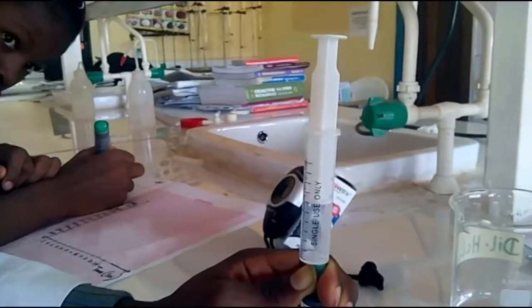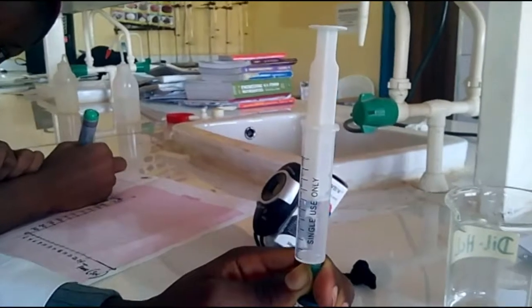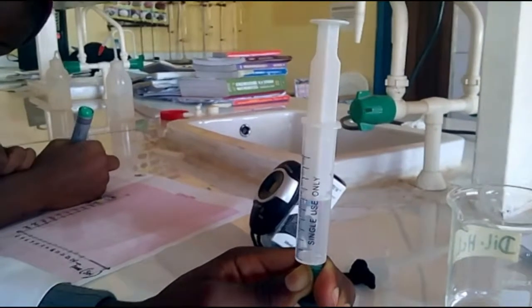As you can see, hydrogen gas is being formed in the syringe.